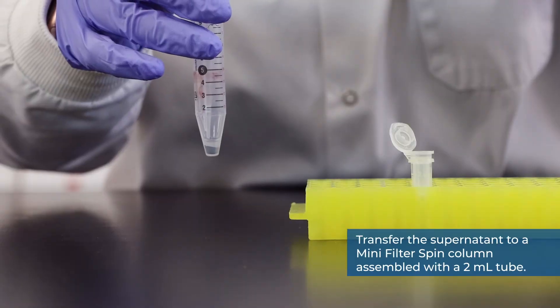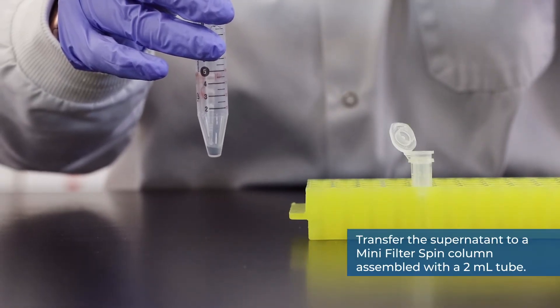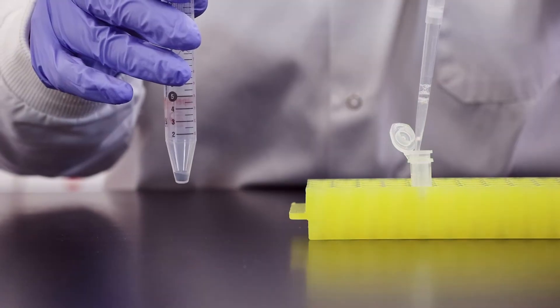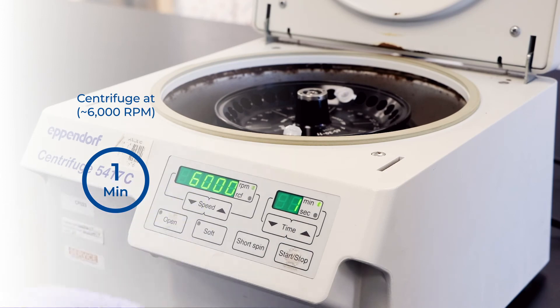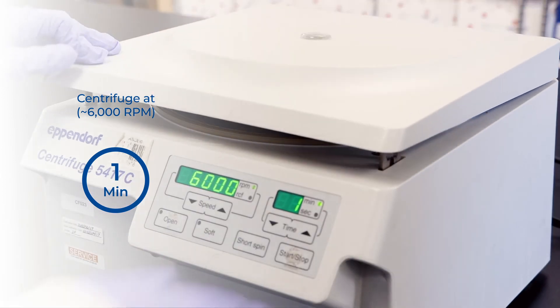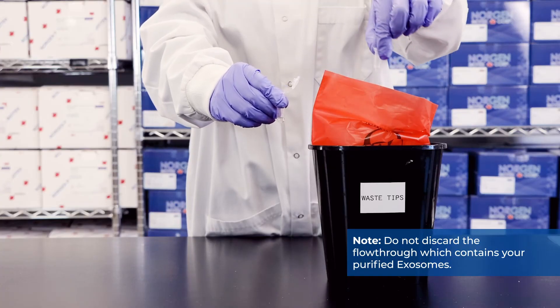Transfer the supernatant to a mini filter spin column assembled with a 2 milliliter tube and centrifuge for 1 minute at 6000 RPM. Do not discard the flow-through which contains your purified exosomes.